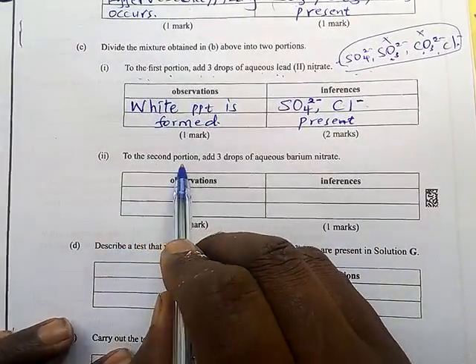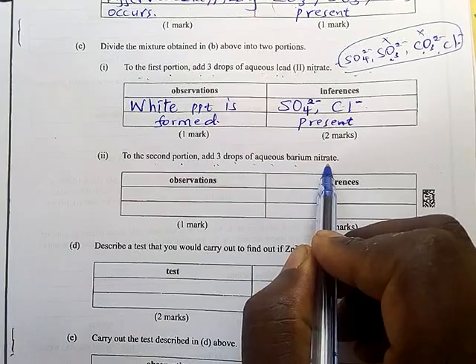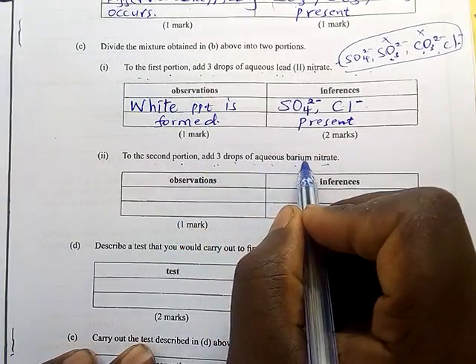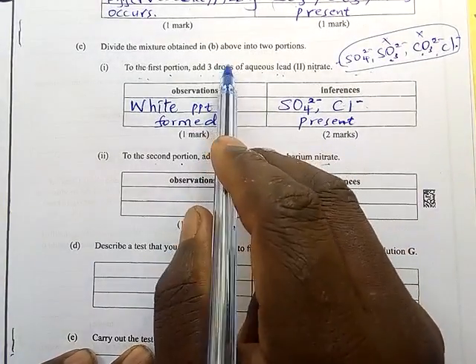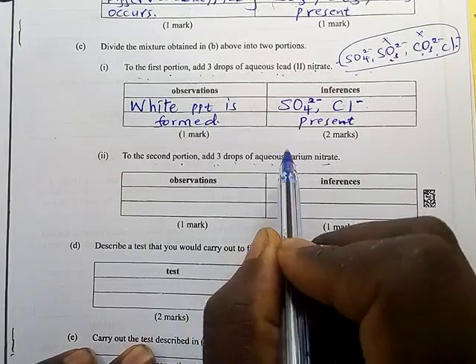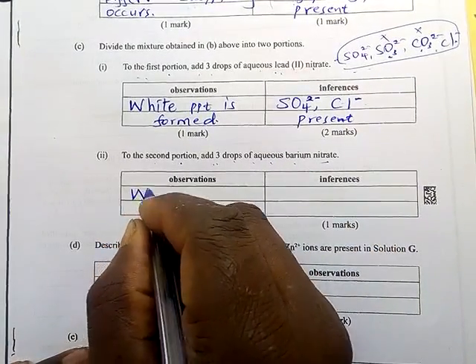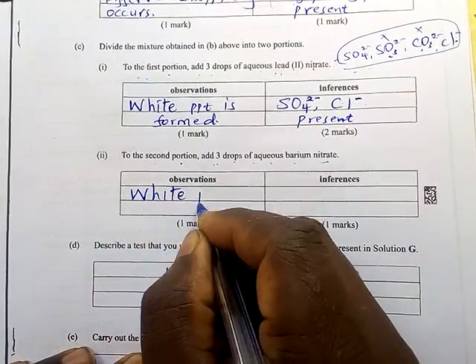To the second portion, add 3 drops of aqueous barium nitrate. We are adding barium nitrate only into this portion here. Remember, this portion contains nitric acid inside. You should know, because the acid was in excess. So what we expect is a white PPT.